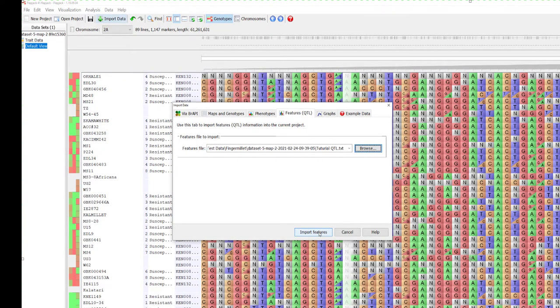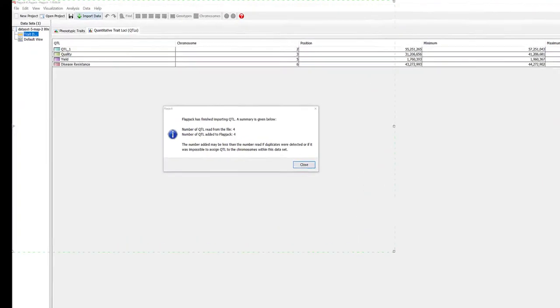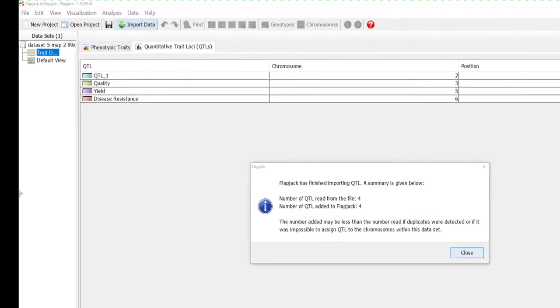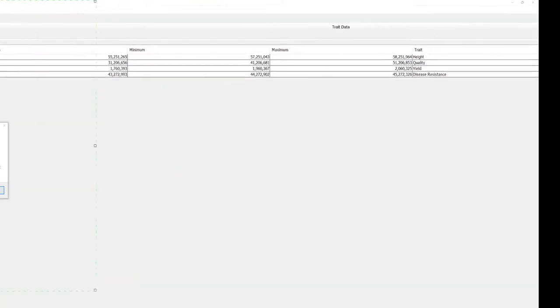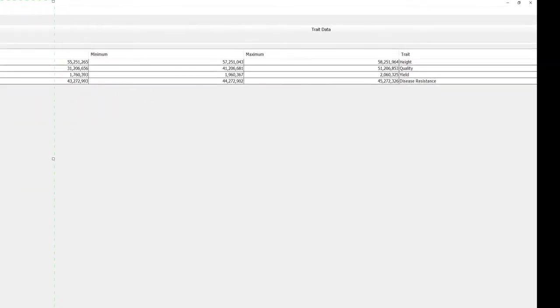The displayed table shows our QTL data, chromosome, location, trait and associated experimental information.